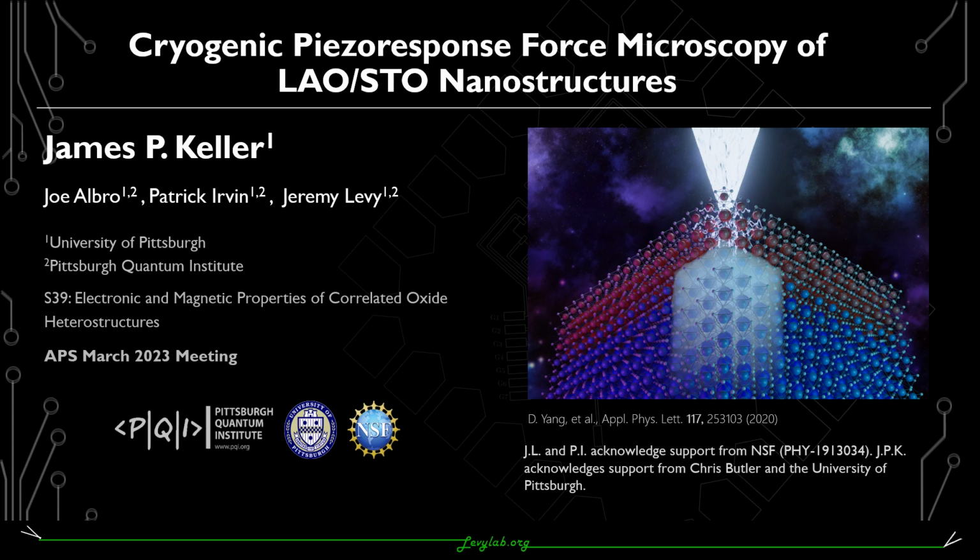Today, I'll be talking about lanthanum aluminate strontium titanate nanostructures being investigated using cryogenic piezo response force microscopy.